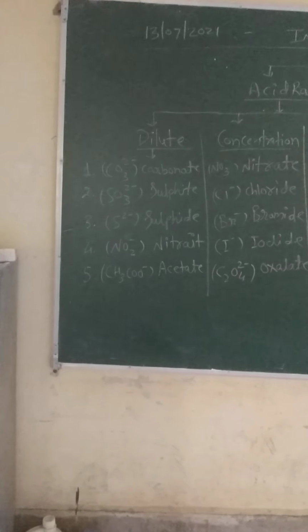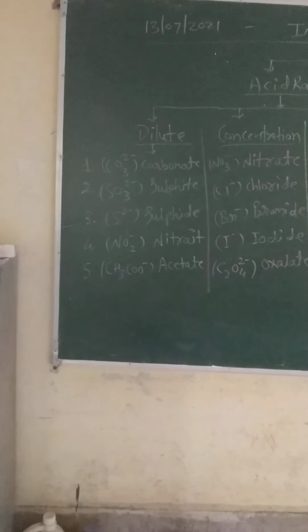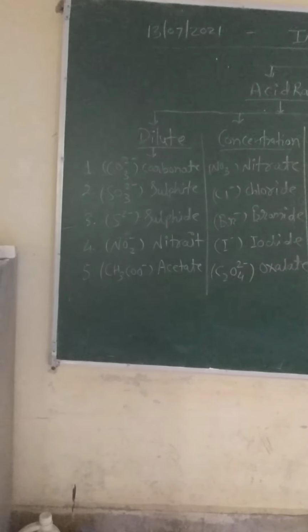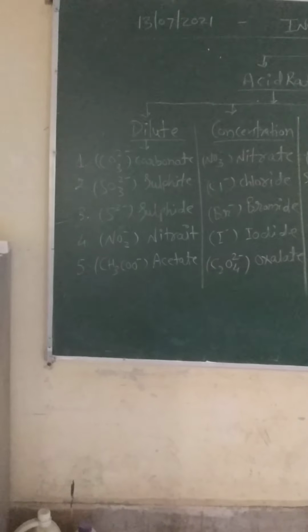Then, how do we confirm whether this radical is carbonate or not? So the second process is a confirmatory test.